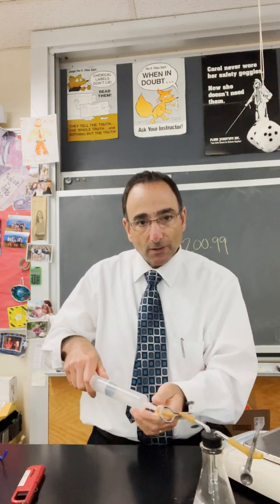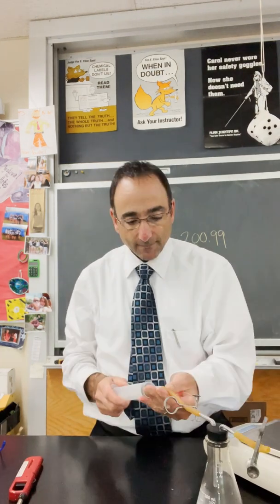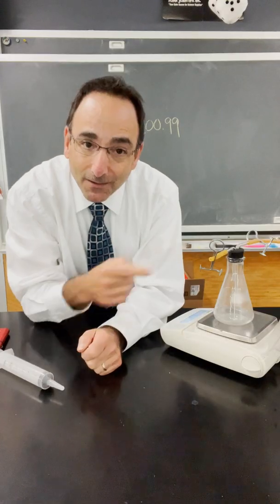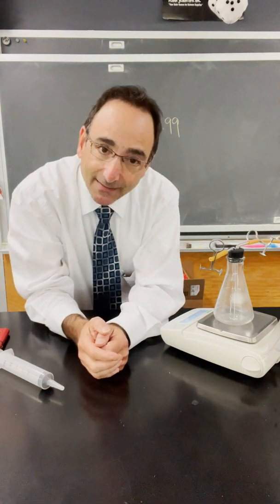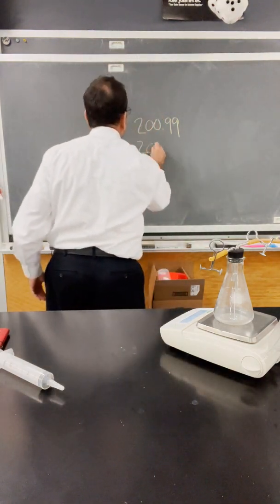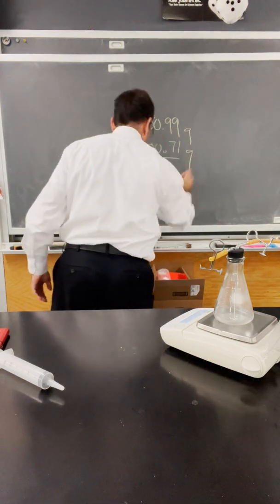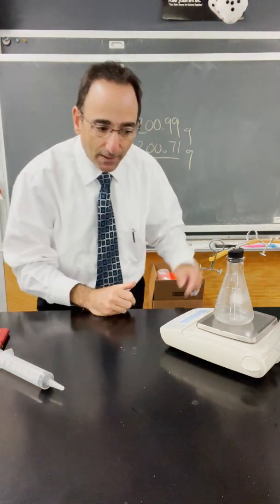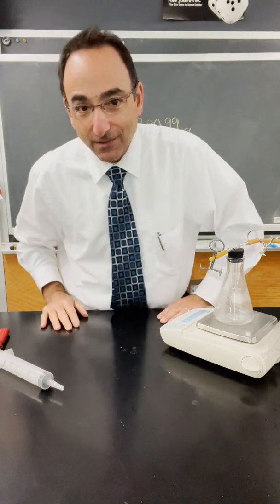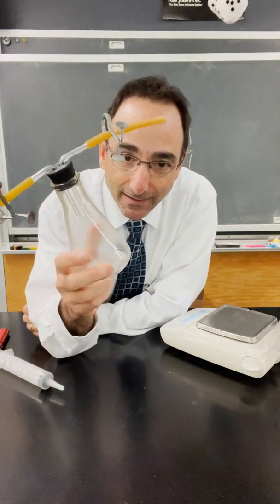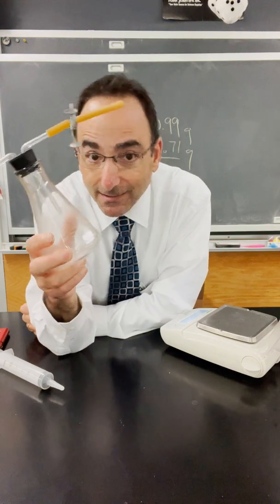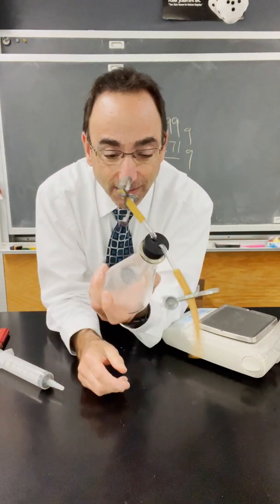It should get quite hard pulling back. Now we're back on the digital balance and we find that the new mass is 200.71 grams. We're going to find the difference between those in a moment, but this is the part that the kids love — even after 30 years it still amazes me. We know how many grams of gas we pulled out, but how much volume of gas did we pull out? You can't see a drop in the gas level in the flask.